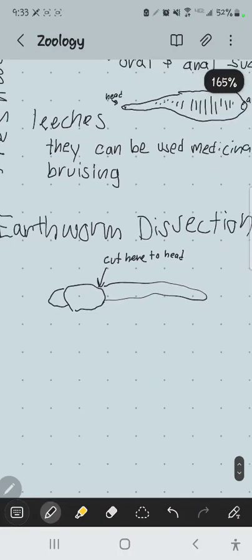We have T-pins at various places around the room here. T-pins like this you can use to open the worm up in the pan. These days with cell phones, it doesn't really matter where you put it in the pan, but if you end up on the exam, I'll use one of these dissecting microscopes to show. Unfortunately, with the dissecting microscopes, if you put the worm right in the middle, you won't be able to see anything. So I'd recommend that when you pin the worm, you pin it off to the side.